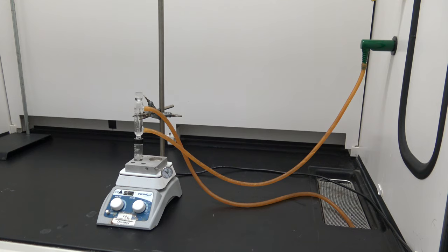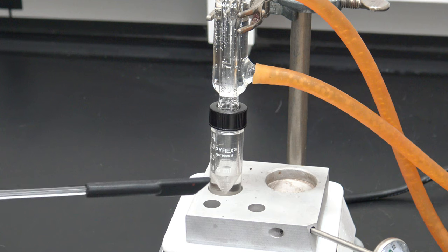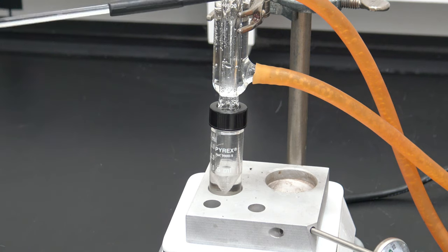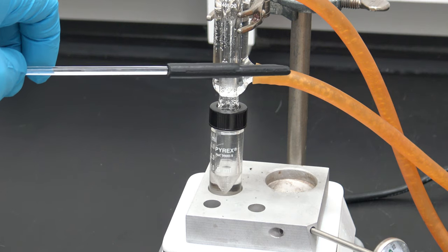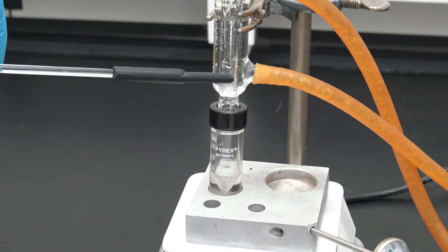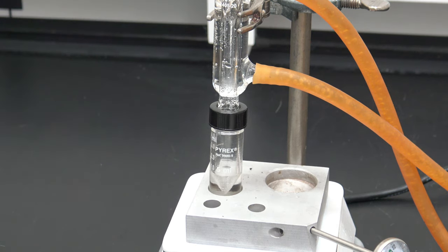I'm now going to zoom in a little bit to get a closer look at the reaction apparatus. My hot plate is just out of the picture, my heating block, I have my reaction vessel, and I have my water jacketed condenser, and my input water and my output water. The reason we have the water going in the bottom is because we want the coldest water near the reaction vessel, because as the water moves up, it's going to get heated by my vapors and then it'll go to the drain.